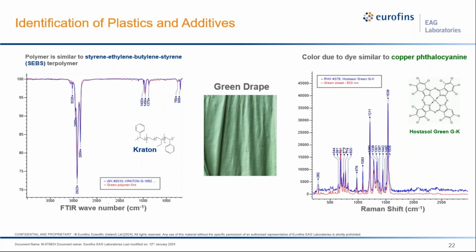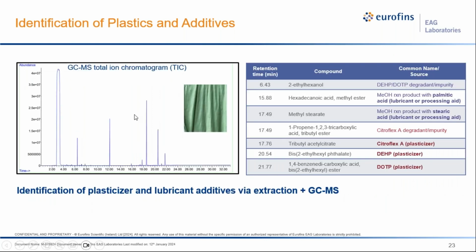Now, if we do GCMS on this, my next slide, we're going to see something completely different yet. So with GCMS, we would take a little piece of this fabric, this drape material, do an extraction on it, and then inject it into our GC. And then this is our total ion chromatogram, so you can see the series of peaks. And what do we find in it? We find various lubricant or processing aids, as well as plasticizers. So now you can see how 3 techniques aimed at one material can be very useful for identifying different components of it.